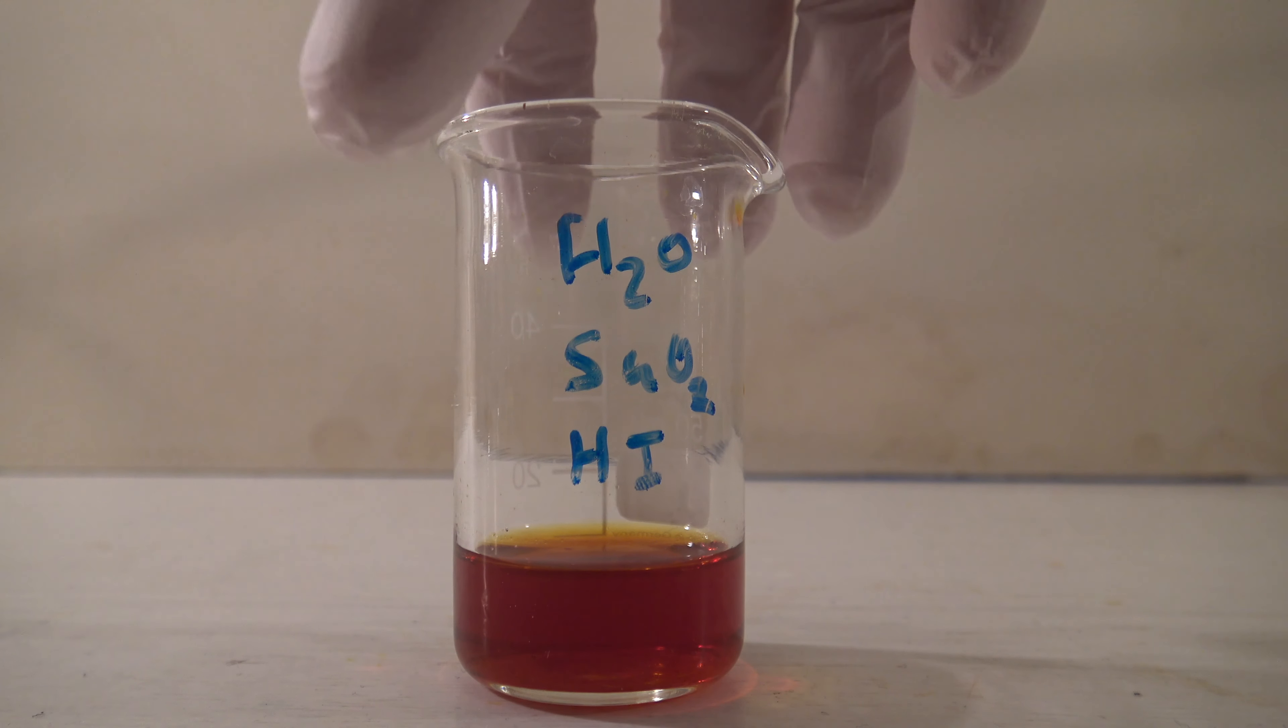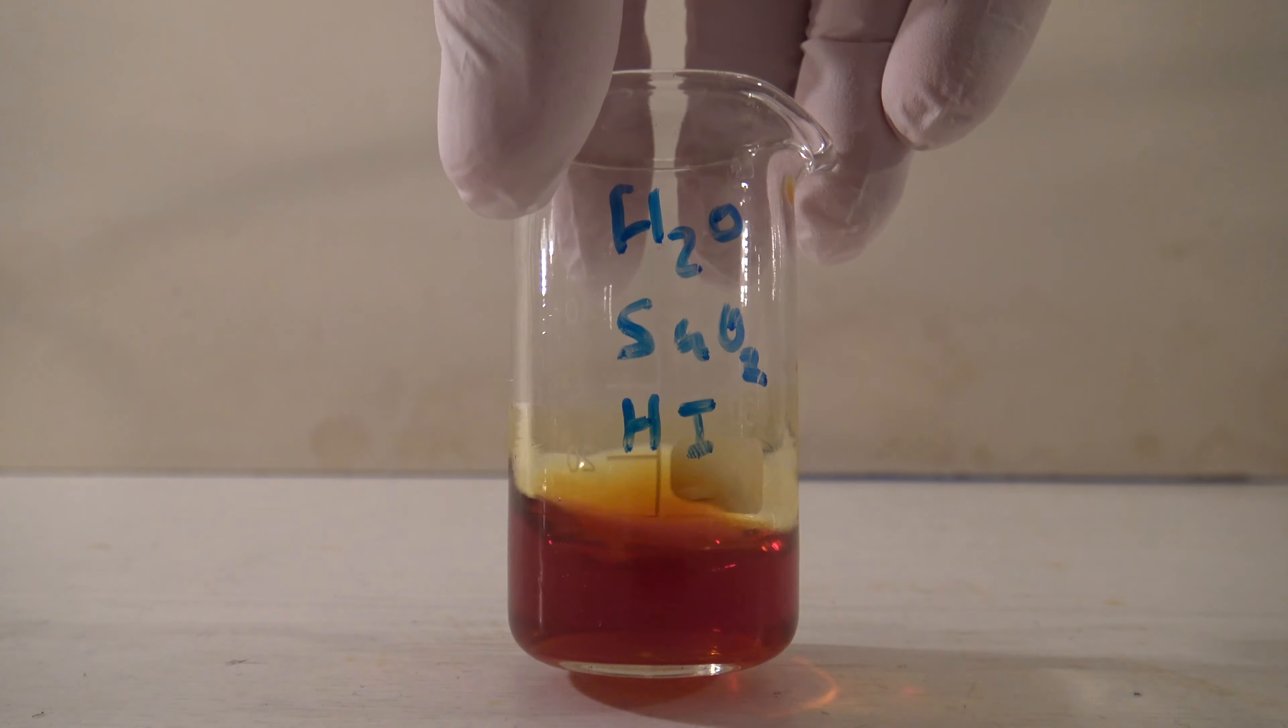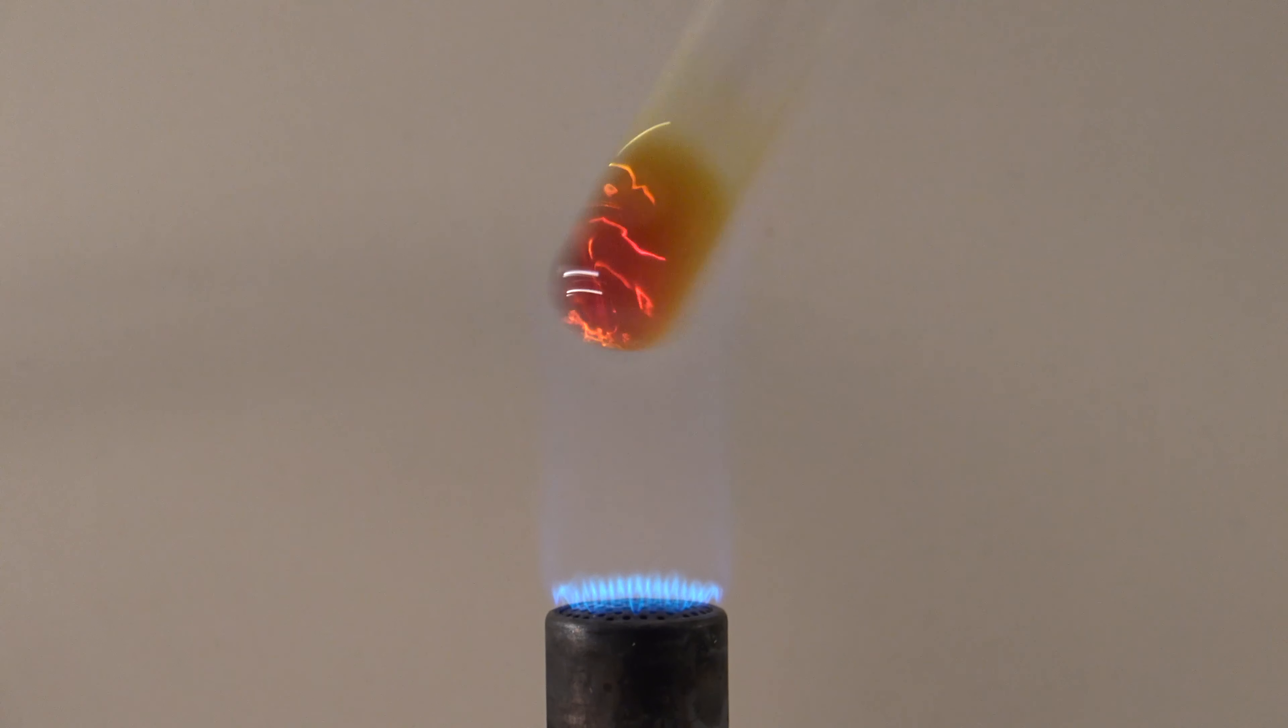The tin oxide goes back into solution after a while but precipitates again on heating. This was the synthesis and a few properties of tin(IV) iodide. I hope you enjoyed, please rate and comment.